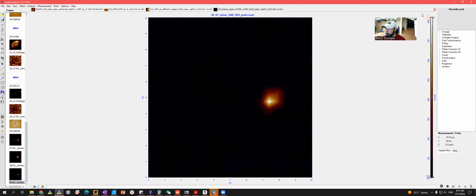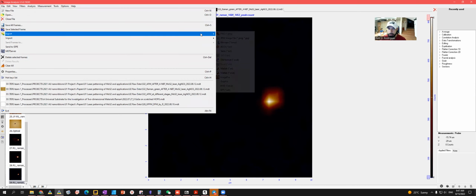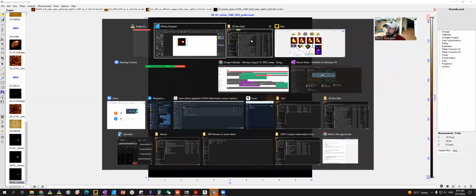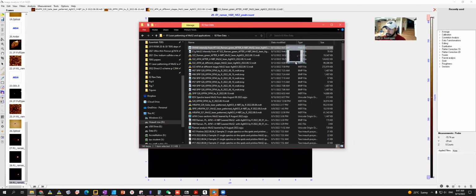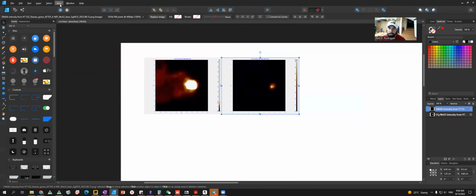Keep it full scale. Let's see what happens if I do this. Support engine. We have the file name of the last one, so I will keep it like this. And this is the DMAB intensity. It's a molecule. Save it. I want to check if this intensity now is not going to be saved there, because if I come here and I try to see the rest of the intensity, I will not see it.